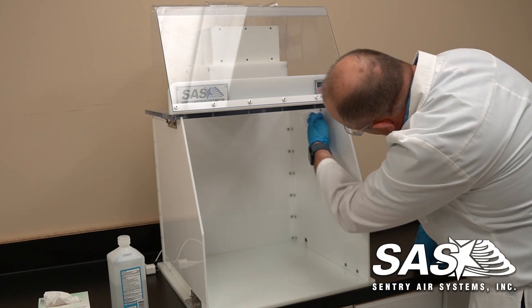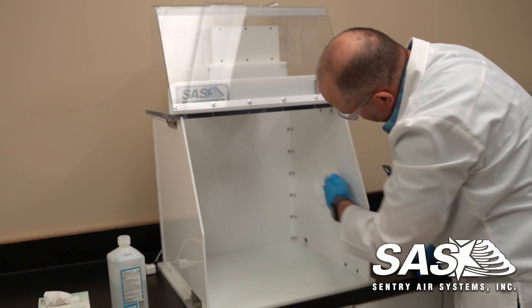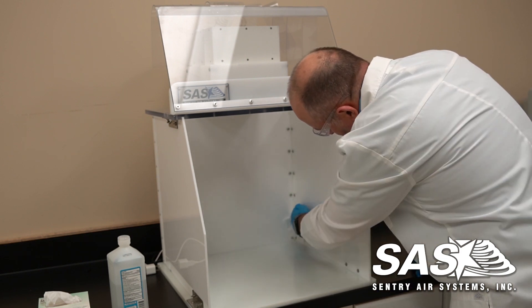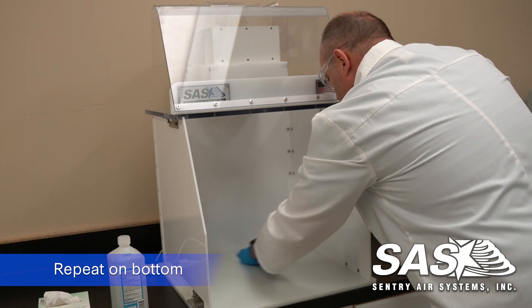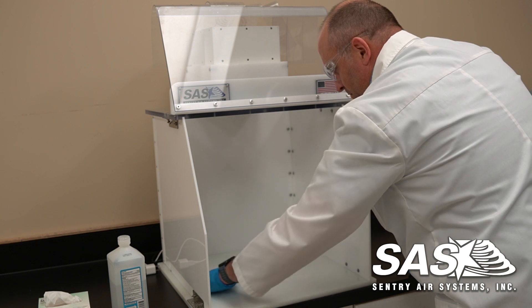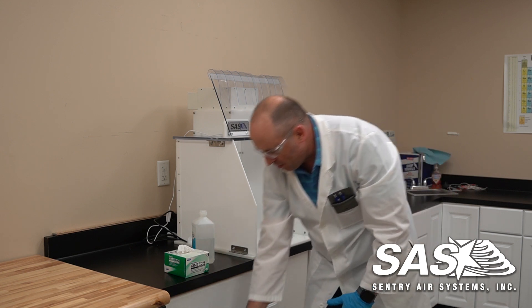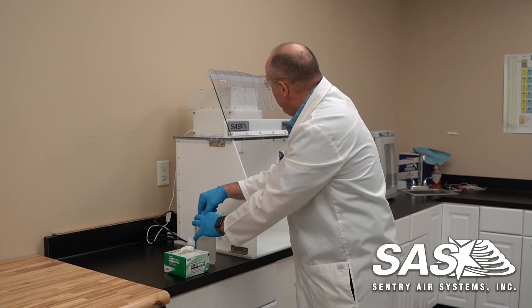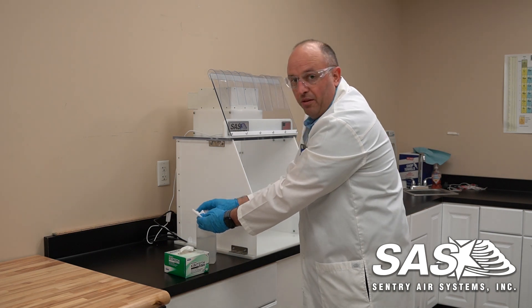Then we'll do the bottom — same process. Start at the back, go side to side, and work your way to the front. You can get another lint-free cloth with alcohol and use this for the front sloping lid.